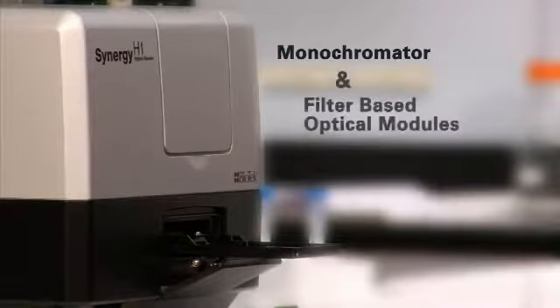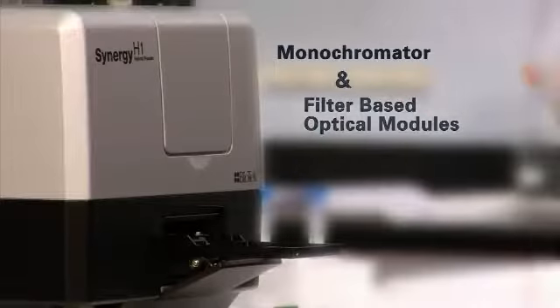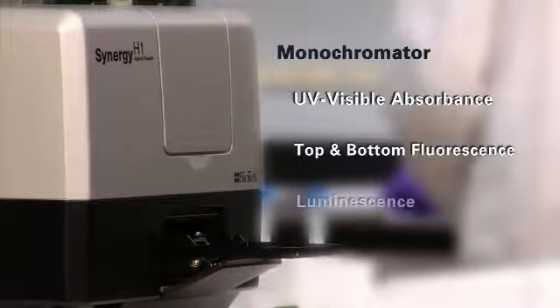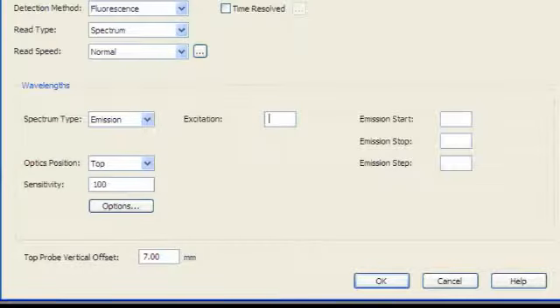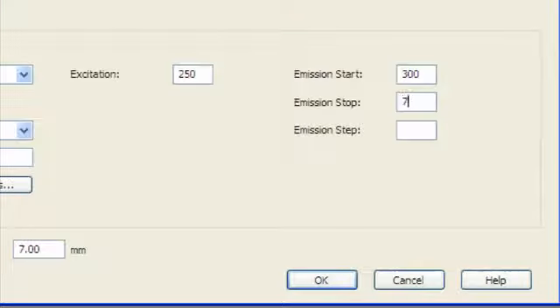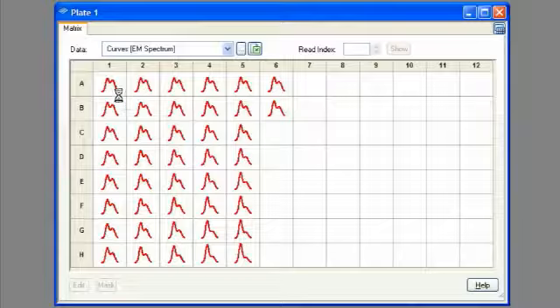Monochrometer and filter-based optical modules. The monochrometer-based module supports UV visible absorbance, top and bottom fluorescence and luminescence. Any wavelength from the low UV to the near infrared can be selected through the software, making this system extremely flexible and easy to use for a wide range of assays.